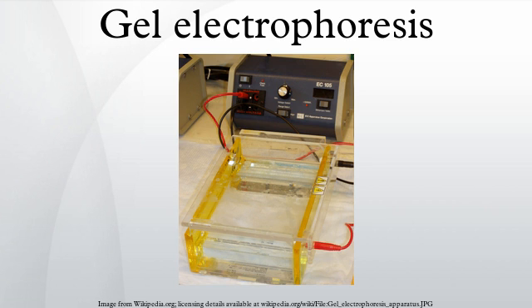In most cases the purported rationale is lower current and/or matched ion mobilities, which leads to longer buffer life. Borate is problematic. Borate can polymerize, and/or interact with cis-diols such as those found in RNA. TAE has the lowest buffering capacity but provides the best resolution for larger DNA. This means a lower voltage and more time, but a better product.